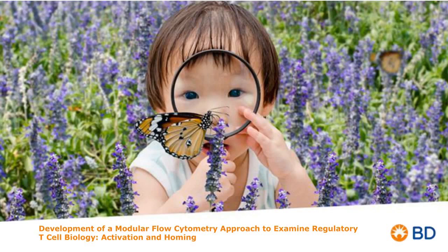But you could also design this panel in another approach where I want to save my best, cleanest fluorochromes so that they're going to be on my drop-in panel, and so I know my base panel will not impact them in any way. And of course, there's multiple approaches to panel design, and it really depends on your specific application and your instrument capabilities.